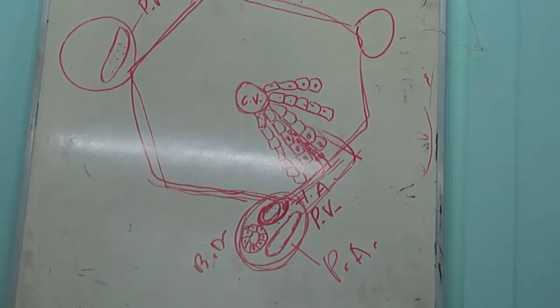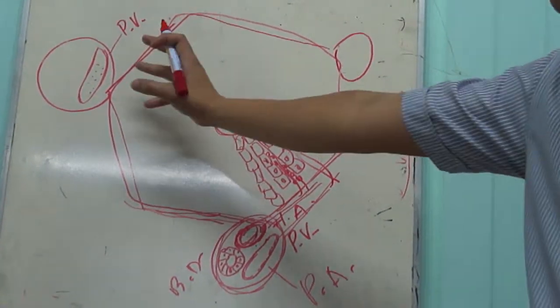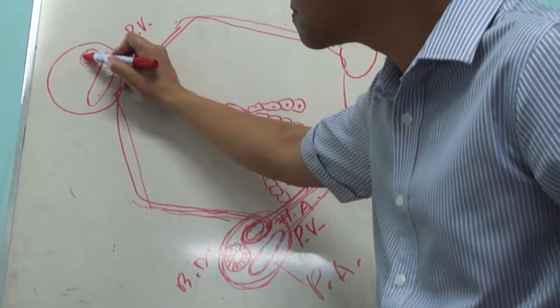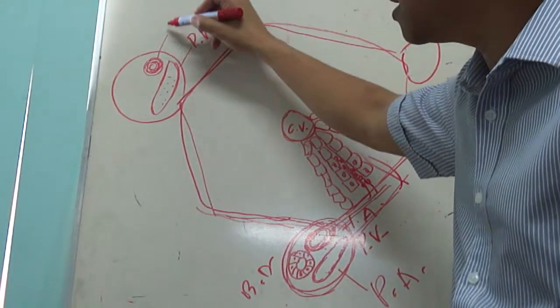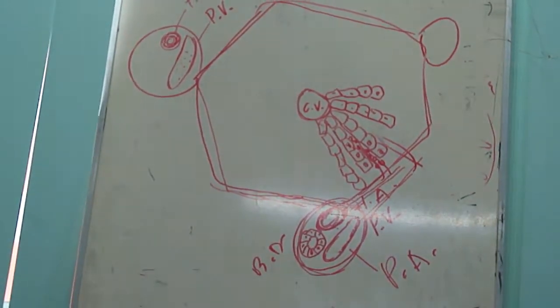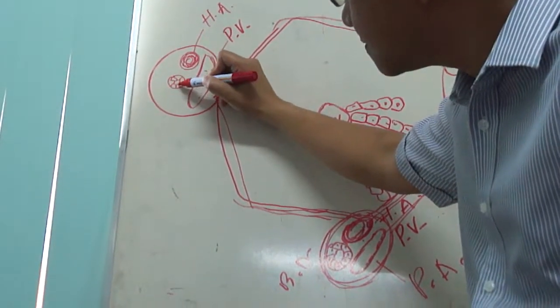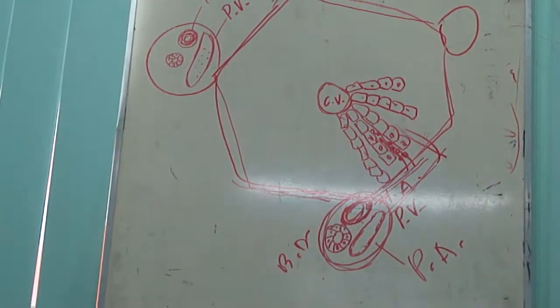The portal vein is a large vein outside of the liver. So that is the portal venule. Okay. Large lumen with thin wall. And then smaller blood vessel but with thicker wall. Hepatic arteriole. Okay, the branch of the hepatic artery, which is the hepatic arteriole. That's the second component of the triad. And then the third component of the triad is lined with a simple cuboidal epithelium, which is called the ductule. Okay, the bile ductule. So those are the three components of the triad.